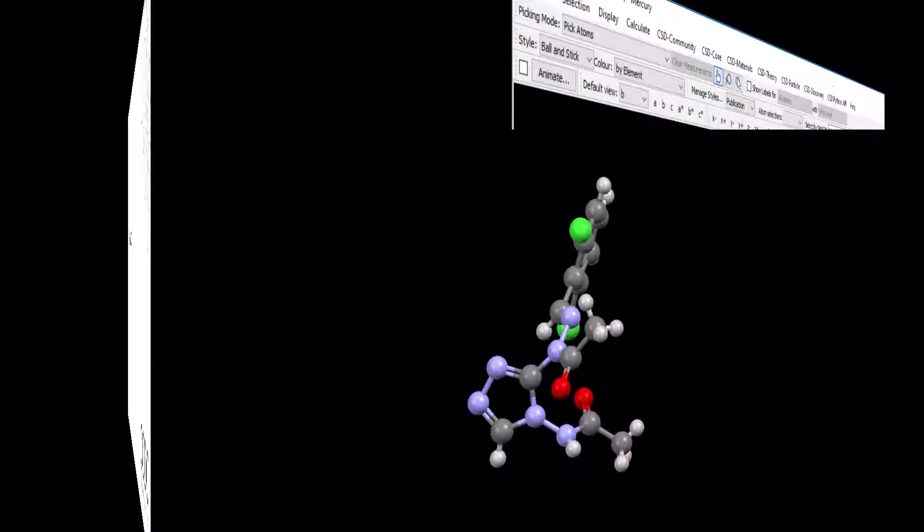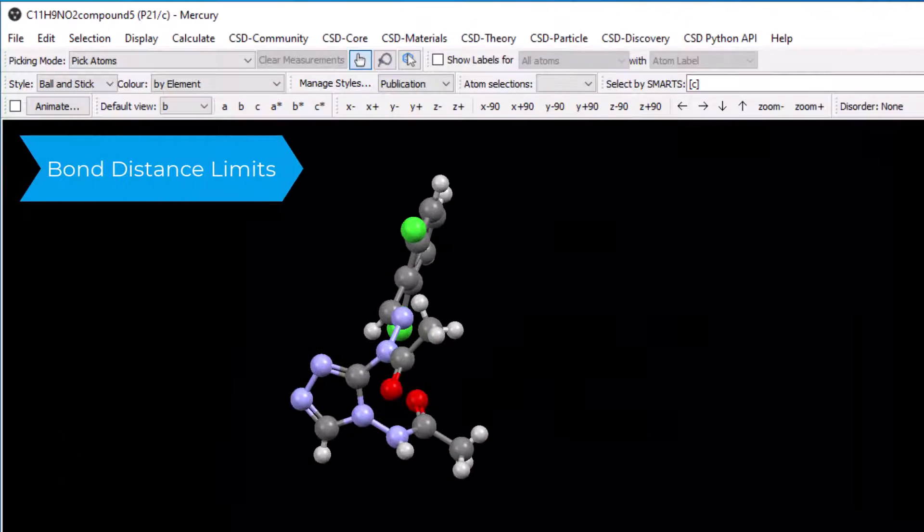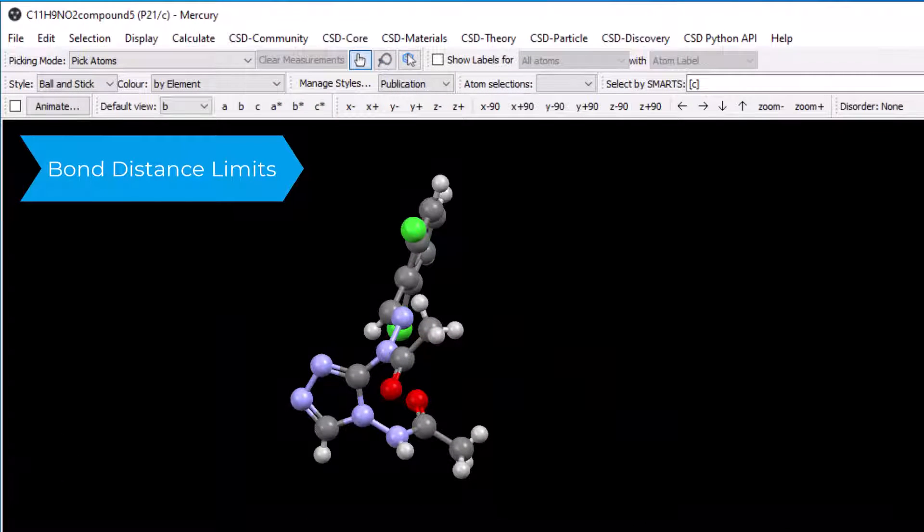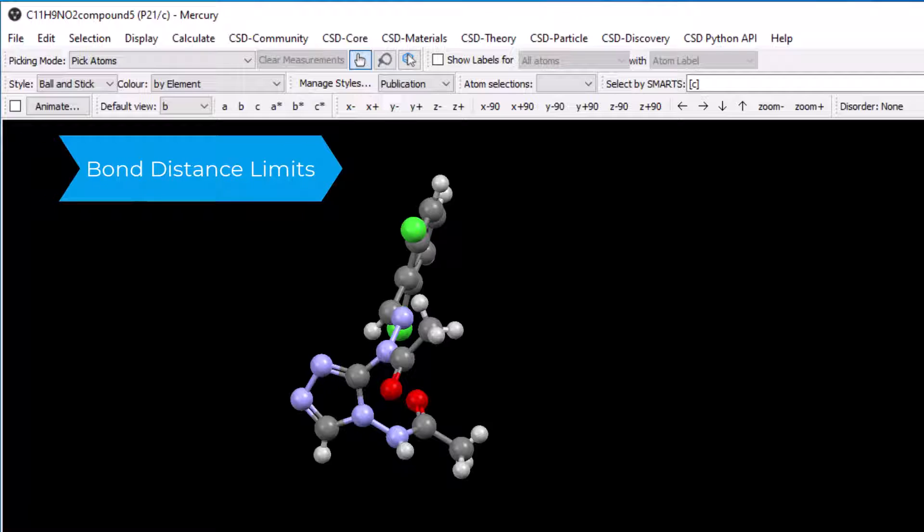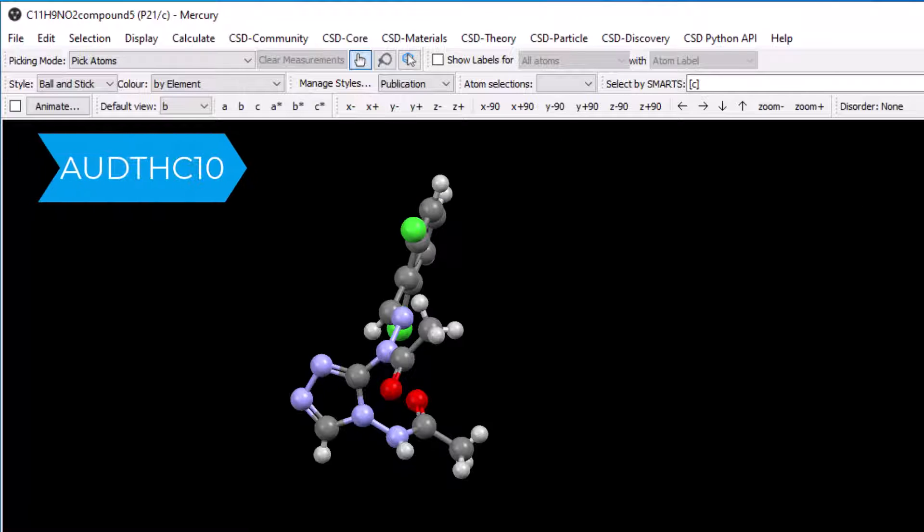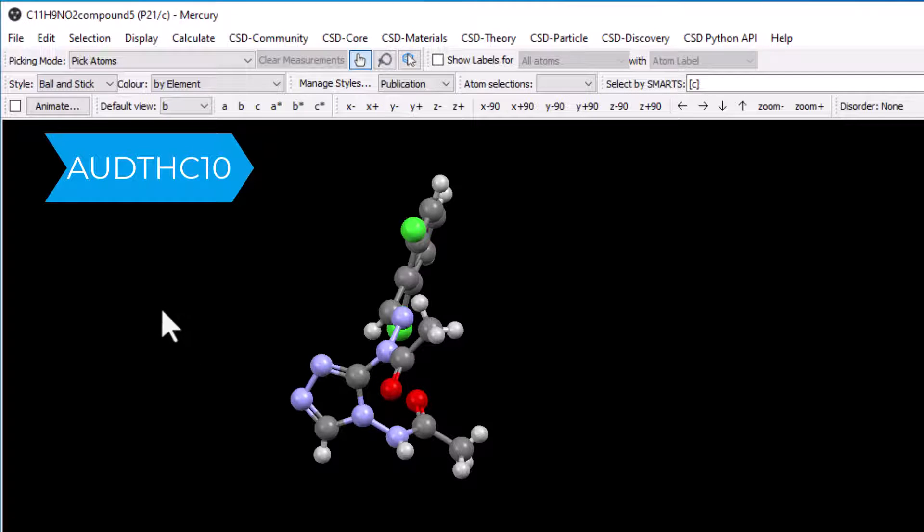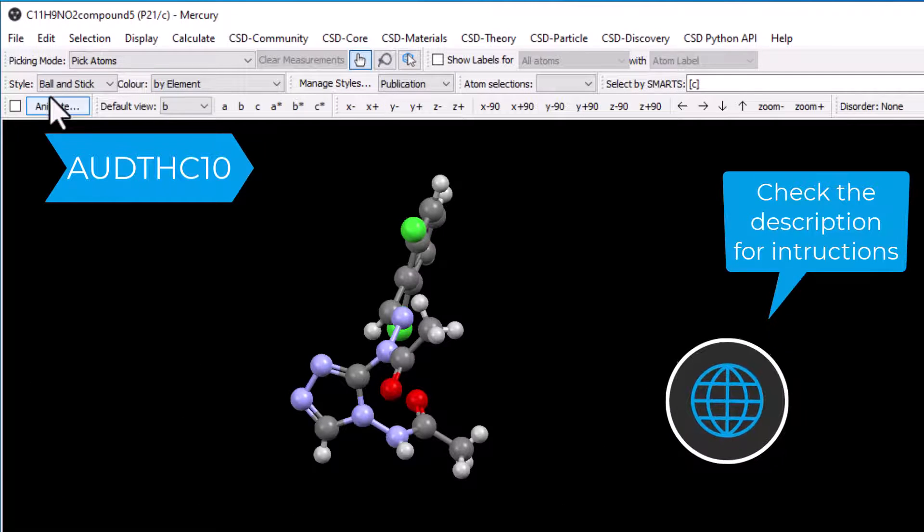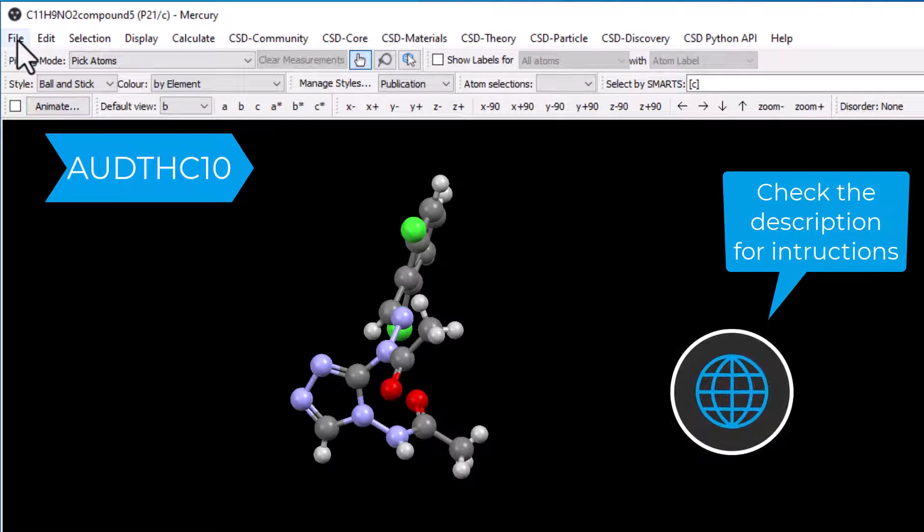The bond distance limits of a structure can be altered. The structure we will look at has the ref code AUDTHC10. Download the CIF file from access structures.